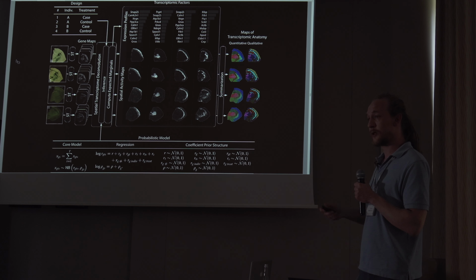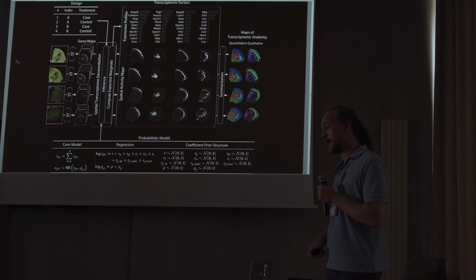These are point estimates we're displaying here, of course. And for this approach, again, due to using optimization, we cannot really very well give uncertainty estimates for these.